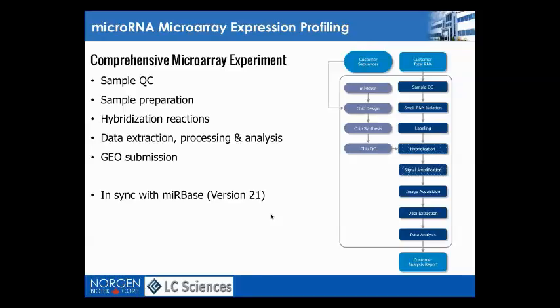I found this particular review paper very interesting because it gives you a good guideline on which method to choose to answer a particular question that you might have, because depending on the sample type and the question that you're trying to answer, you might want to use a different method.